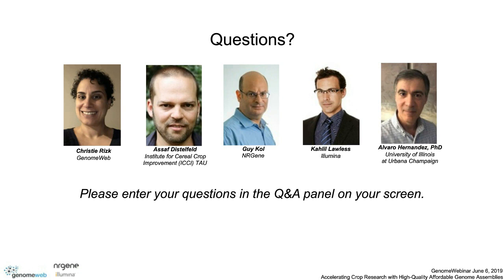And Alvaro, how long is the overlap between reads 1 and 2 when you fuse your 2x250 fragments? Yeah, so Guy can also answer that, but basically it's anywhere from 10 to about 40 base pairs. That's what we aim for in the libraries. Guy, do you want to add anything? No, that's actually very correct. So it's about 40 bases with a distribution, but the bulk of the distribution is around 40.